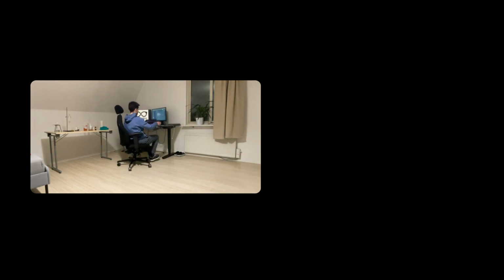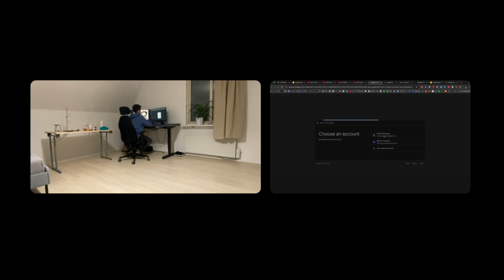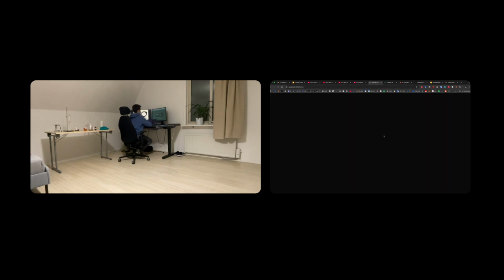So let's have a look at the video that has hopefully already been generated. This is our YouTube for experiments, that's how we call it, where all the videos are automatically uploaded and processed for the documentation.